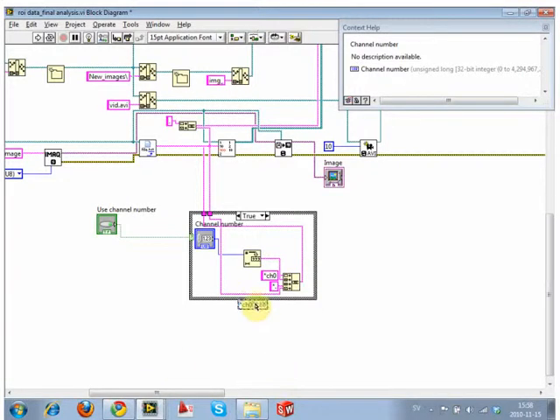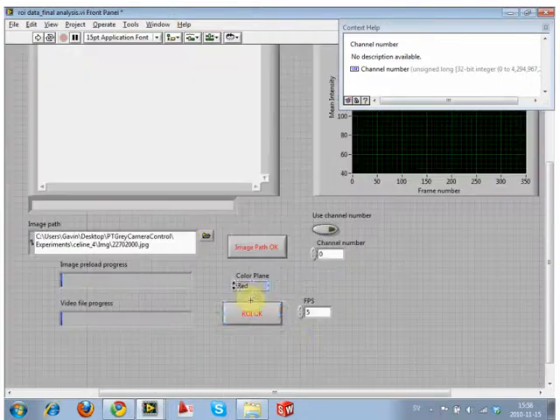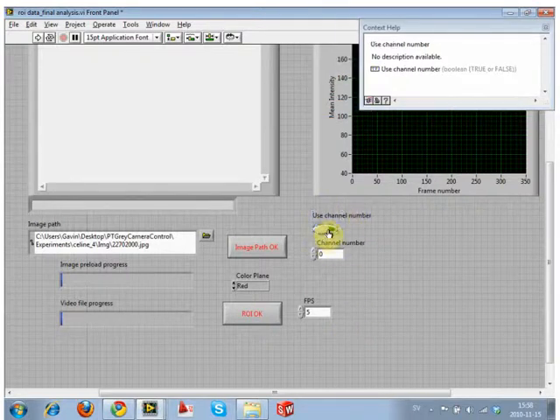So now we've modified it so it'll do essentially the confocal data sets. But rather than having to type in that whole string each time, we just pick a file and choose if we want this switched on or not. And we don't have to type in any filter string. With it switched off, it just uses the file extension. With it switched on, it reads this channel number and does the rest for us.